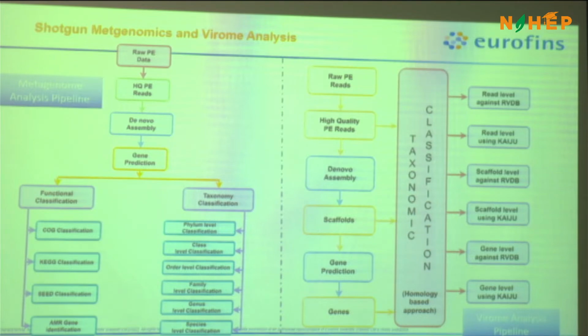So what we do is, again, we do a filtration of reads. The only difference is that we don't stitch the reads here. Why don't we stitch? Because there is no amplicon here. We don't have an amplicon which we have to make and then go for the sequencing. So we take the entire reads for de novo assembly. We assemble the entire reads. I hope everybody understands what an assembly is, right? Yeah, so we do a de novo assembly.